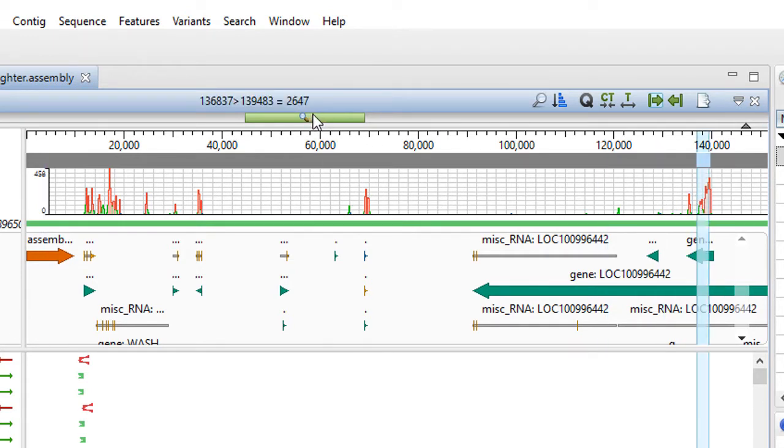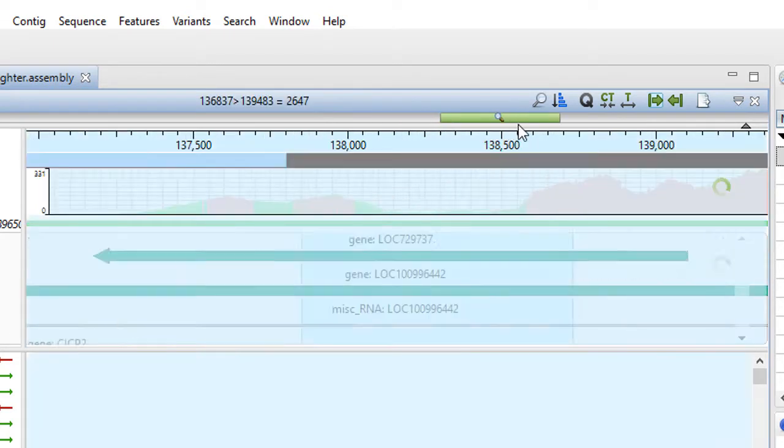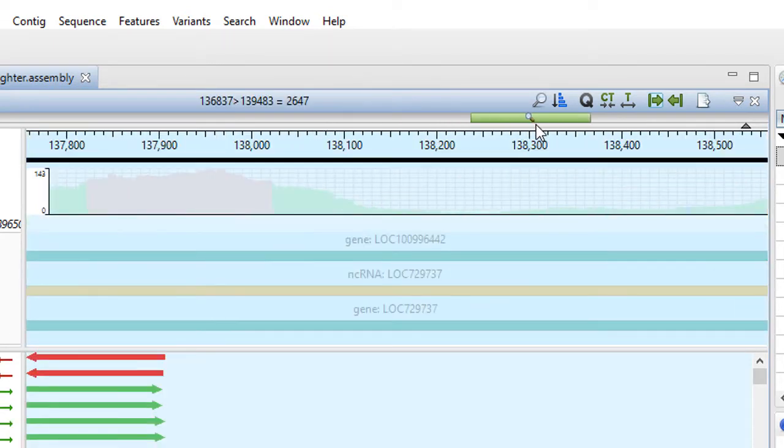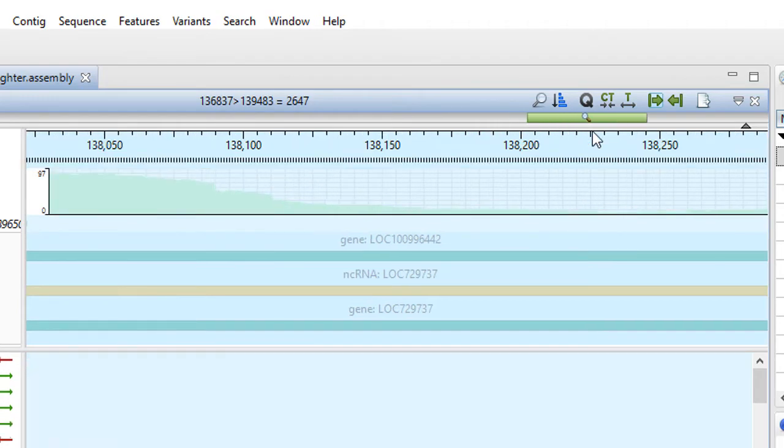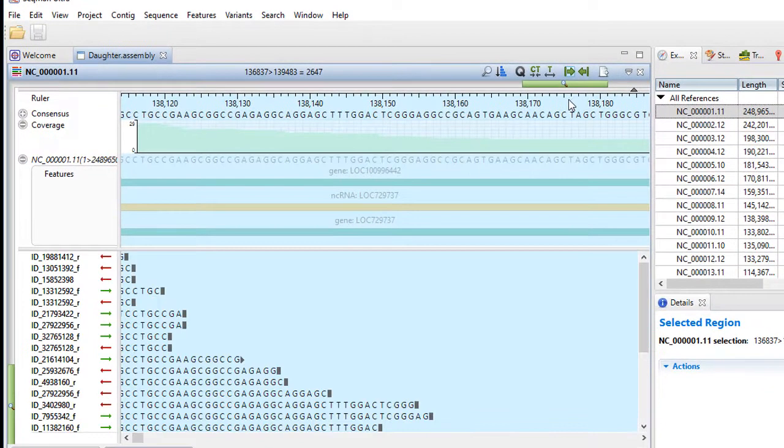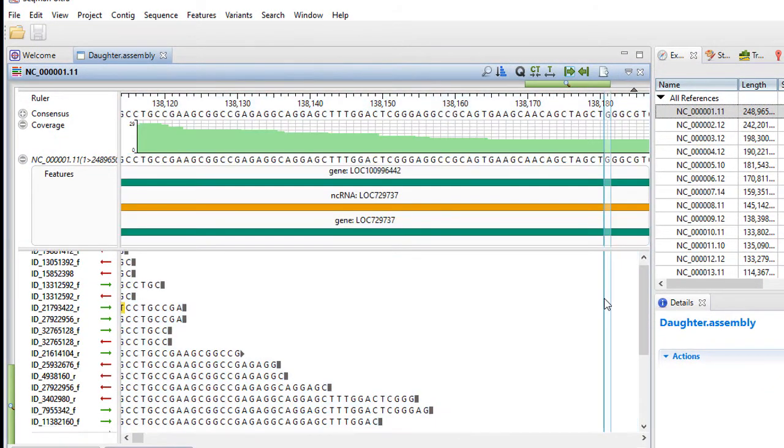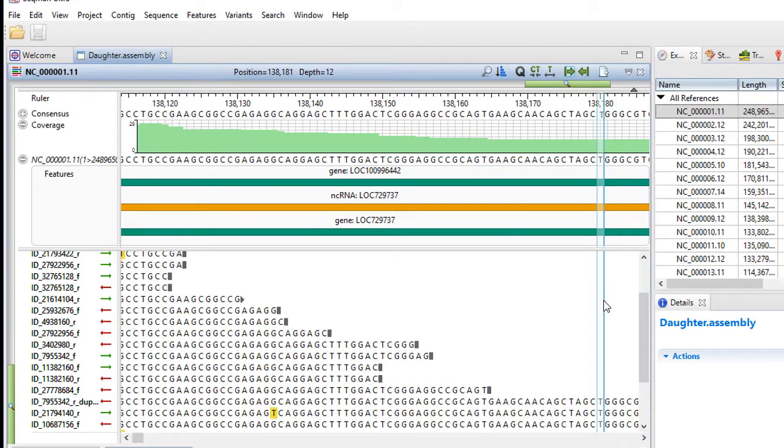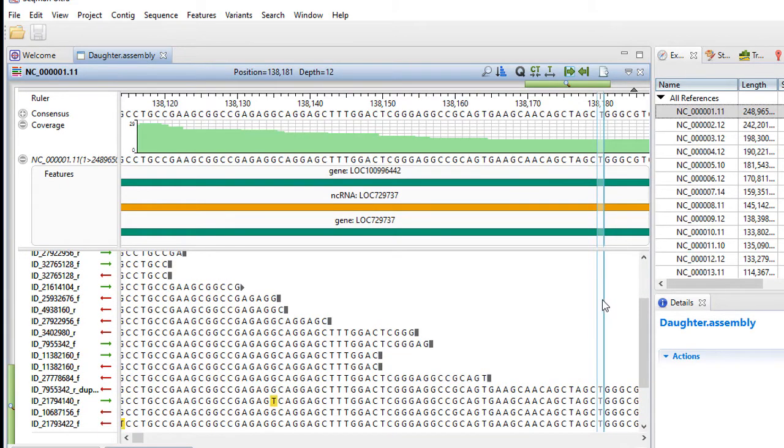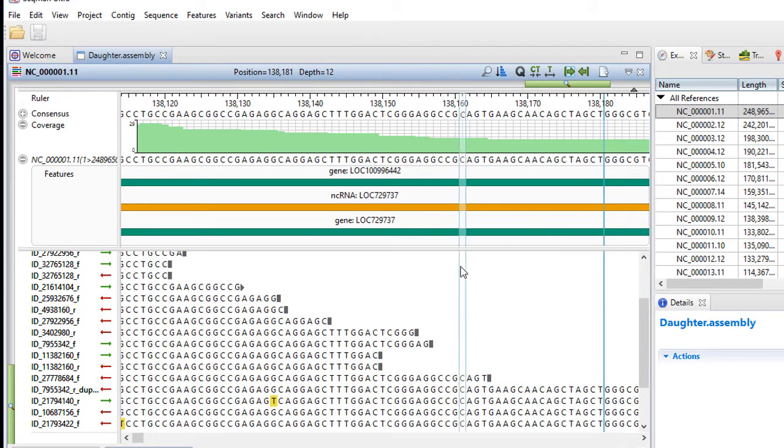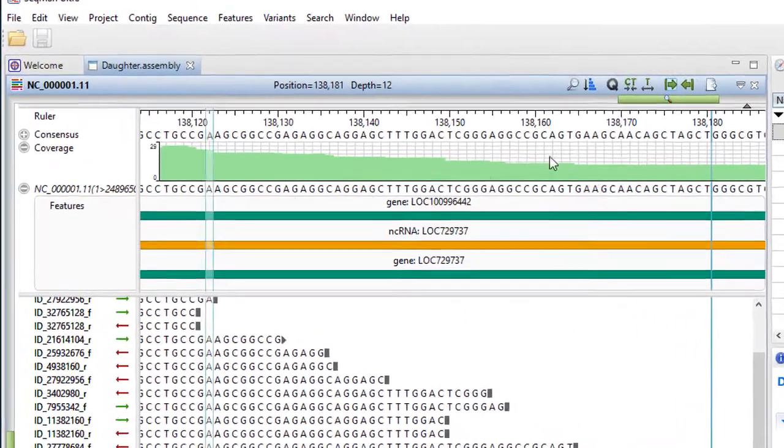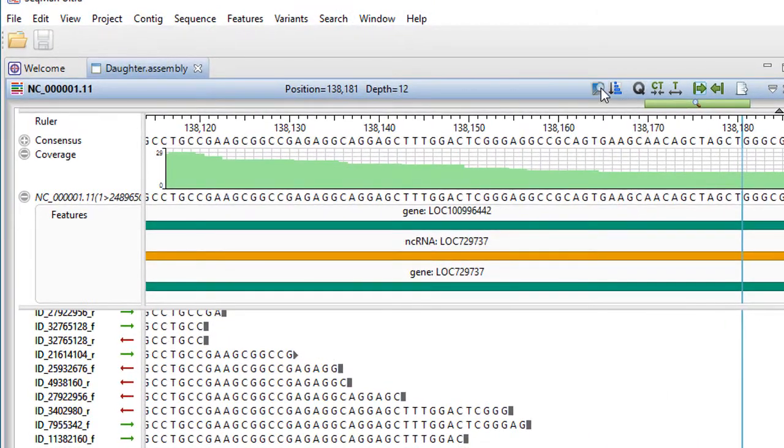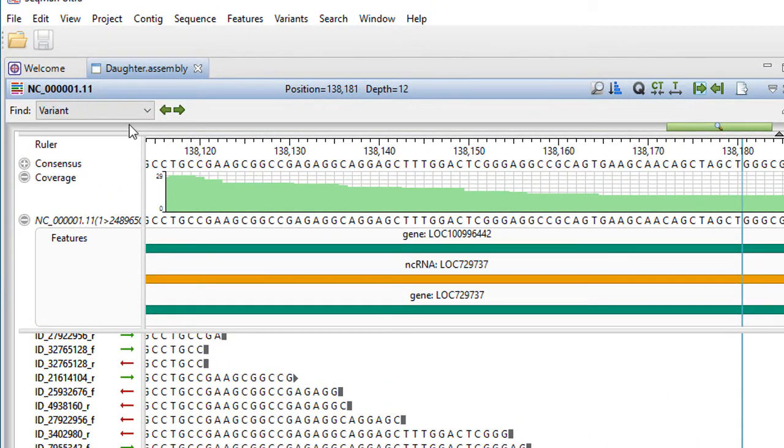Zoom in on a selection to investigate the alignment in more detail. Here you'll be able to see variants, as well as features and coverage. You can navigate to different areas of interest using the search tool.